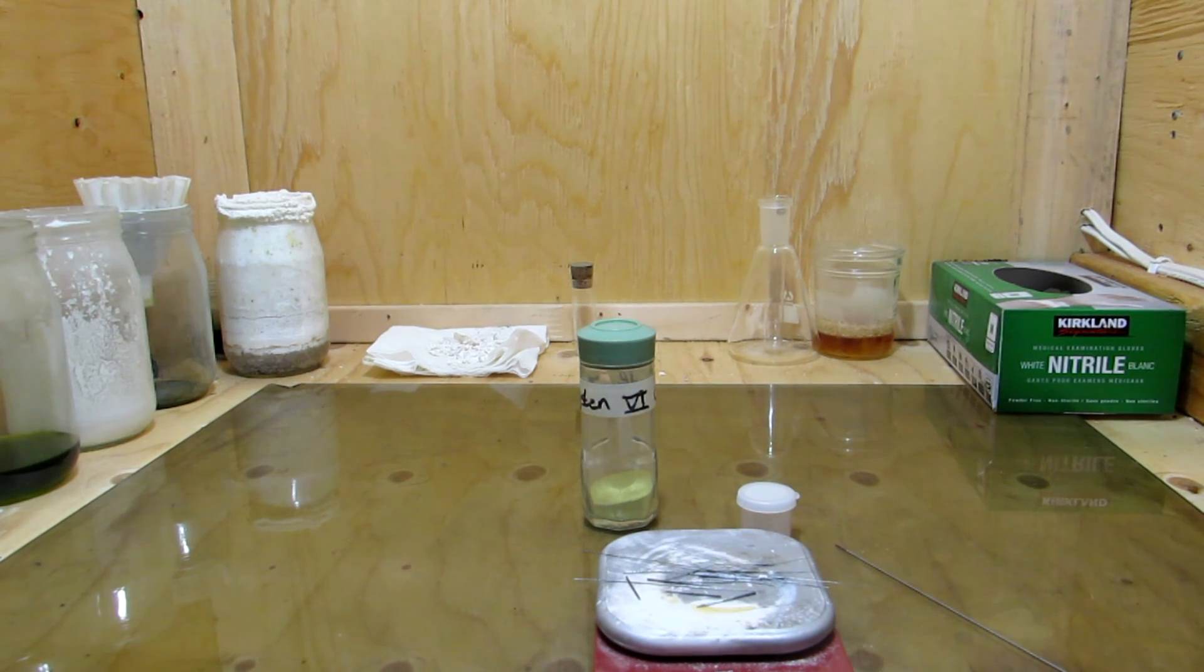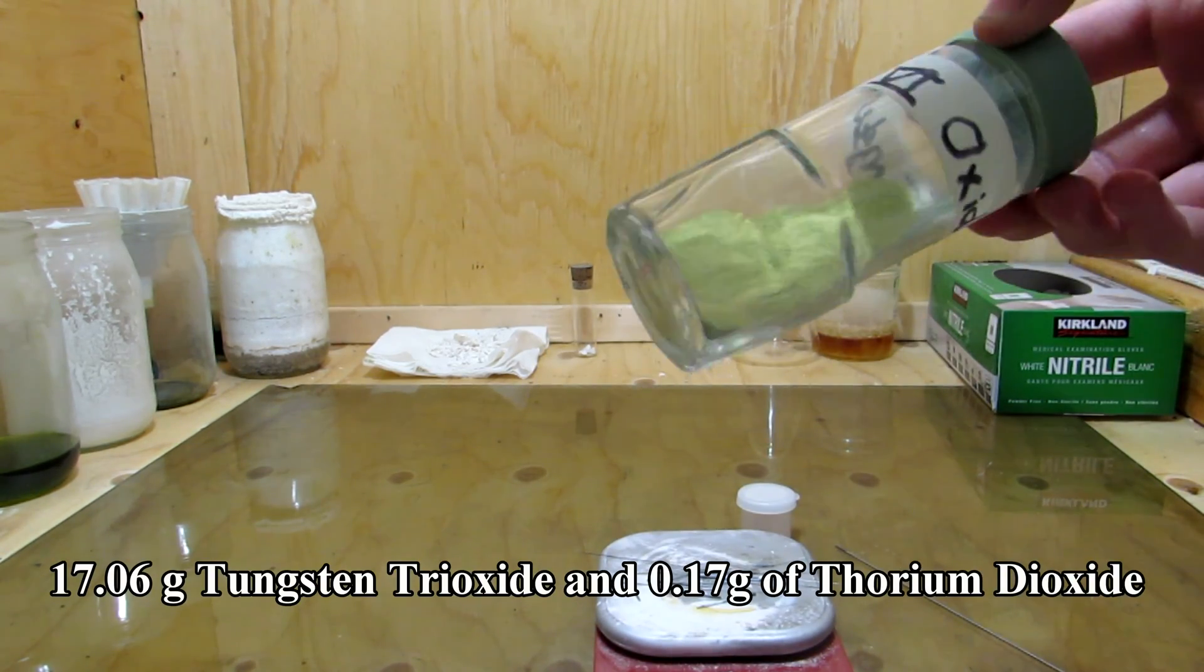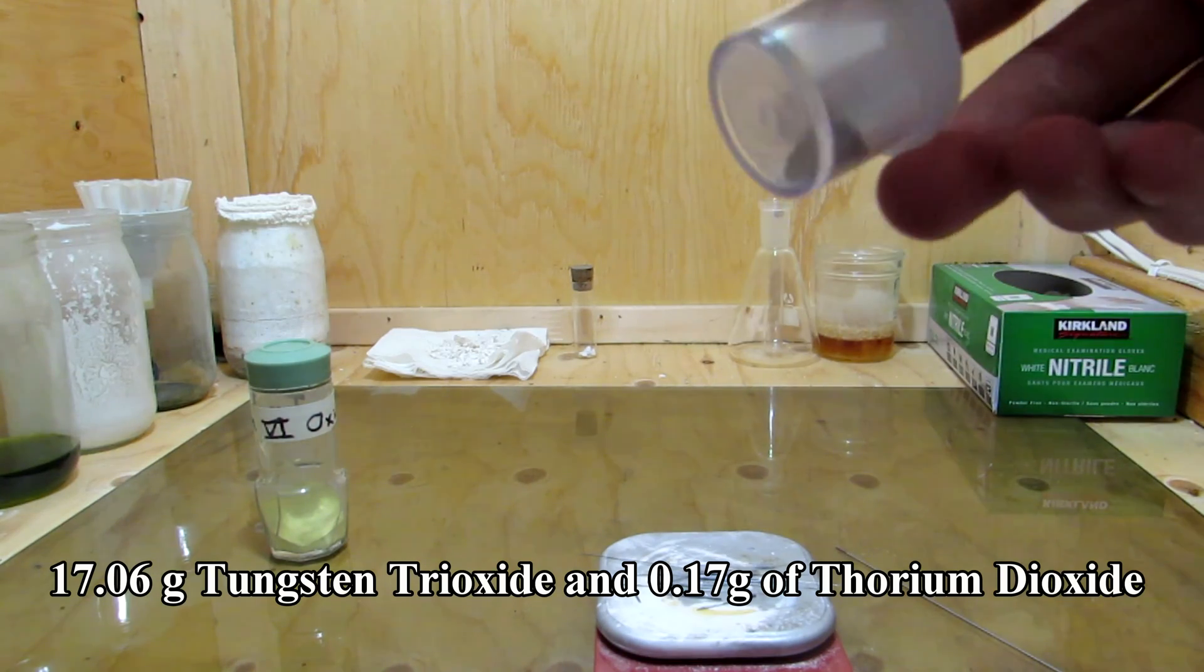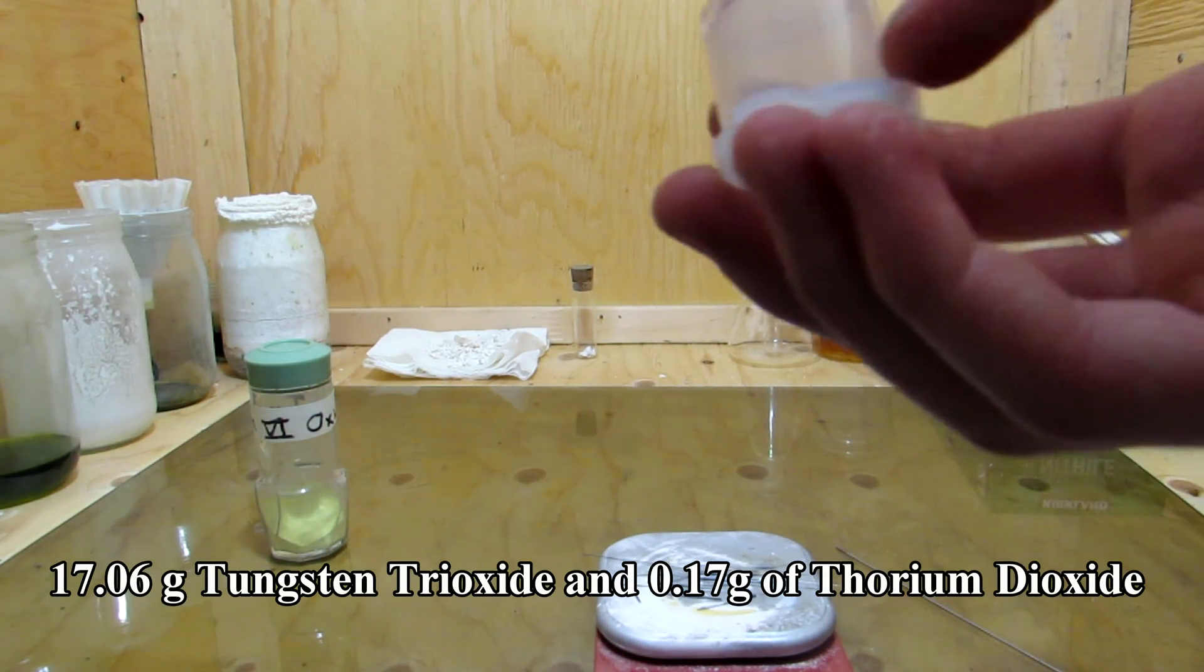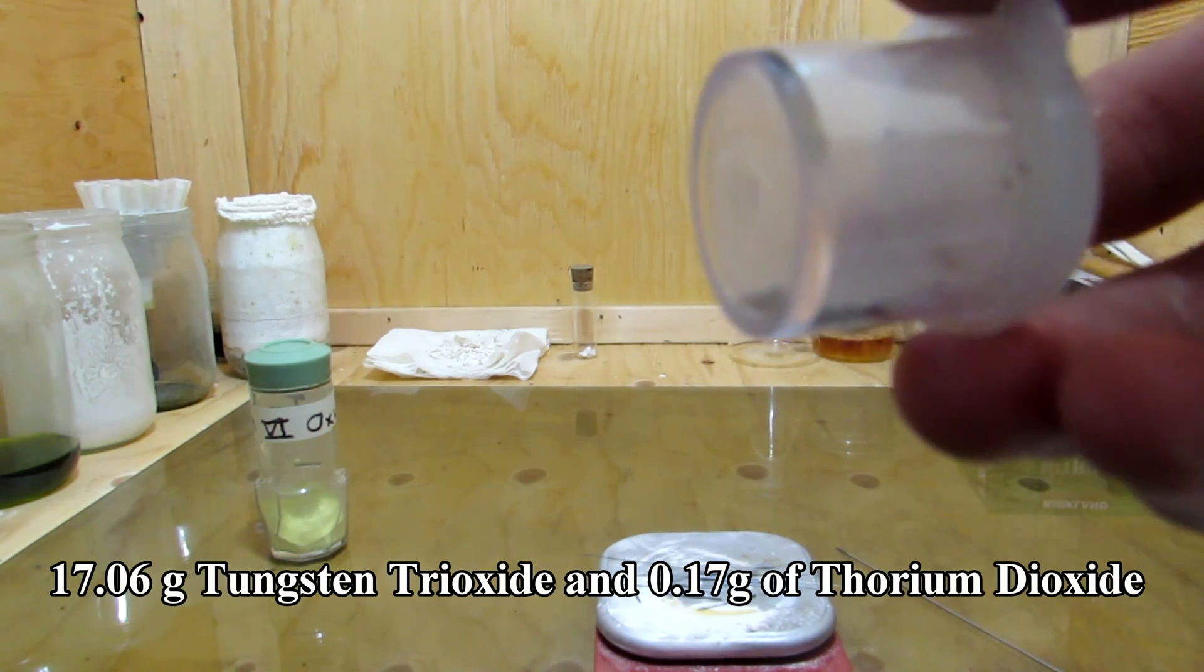After dehydrating the tungsten trioxide and thorium dioxide, 17.06 grams of tungsten trioxide and 0.17 grams of off-white thorium dioxide was obtained. From the 9 rods dissolved, 0.40 grams of thorium dioxide was expected.